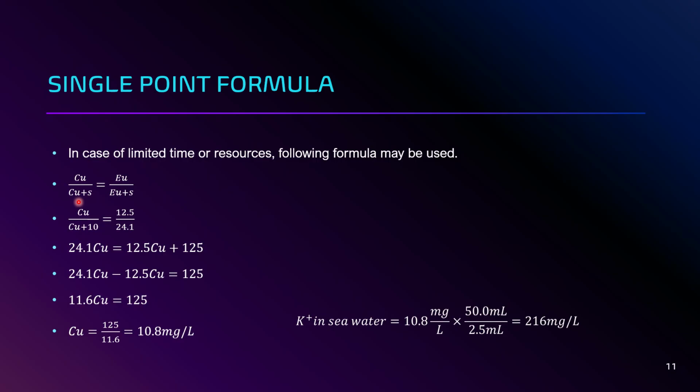If you're talking about your experiment, you can take any flask giving exactly the data point on the line. The best data point can be chosen here. For example, it could be a 10 ppm flask point. So if you take 10 ppm flask, this concentration of unknown plus 10 ppm, I have written here 10 ppm.